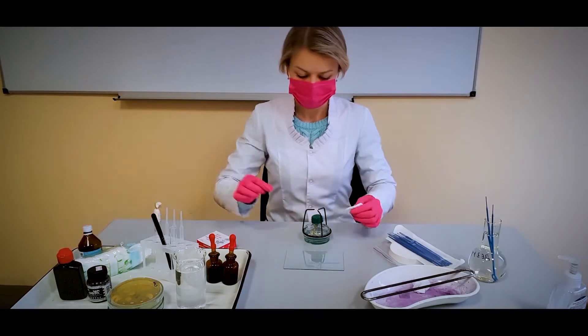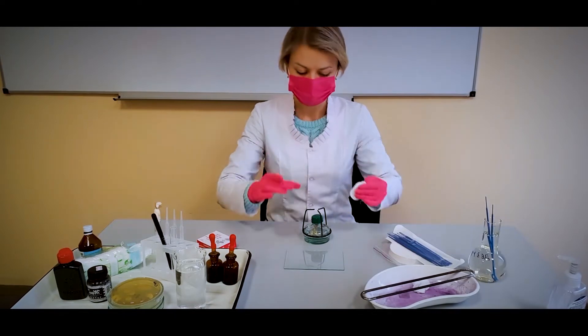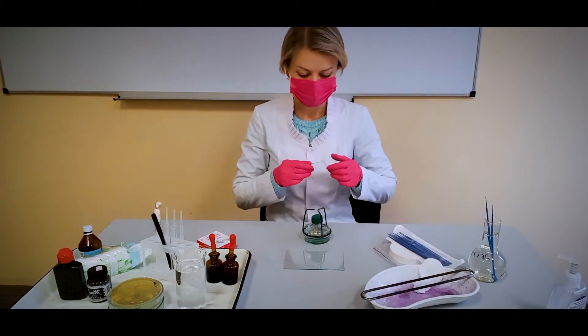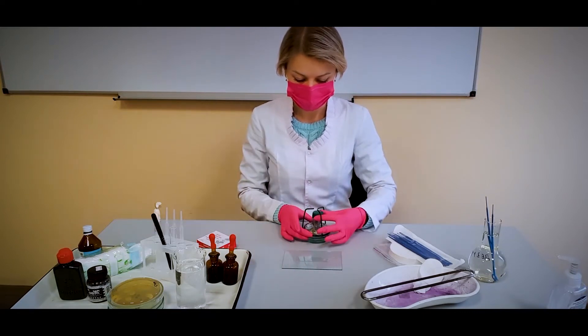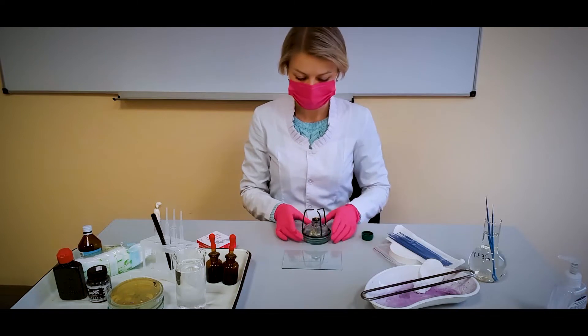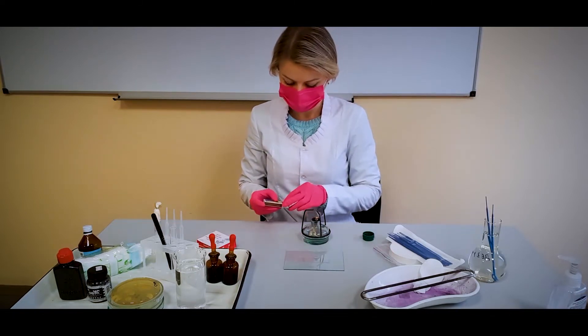Most bacterial capsules are composed of polysaccharide; however, some generally produce polypeptide capsules. The polymers which make up the capsule tend to be uncharged and, as such, they aren't easily stained. For this reason, we use a negative stain to visualize them.